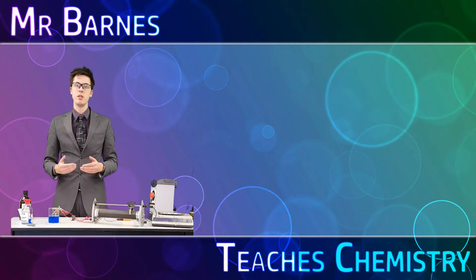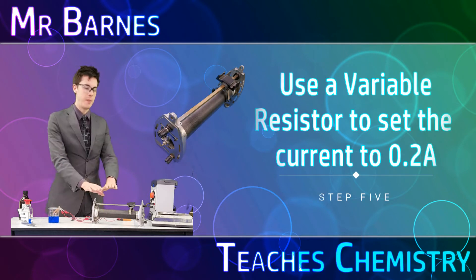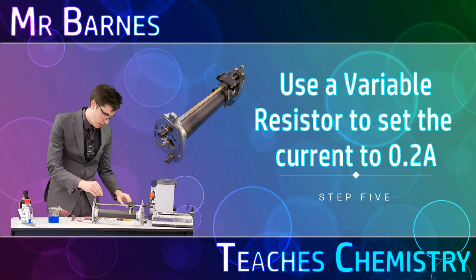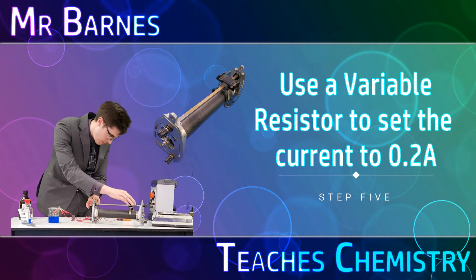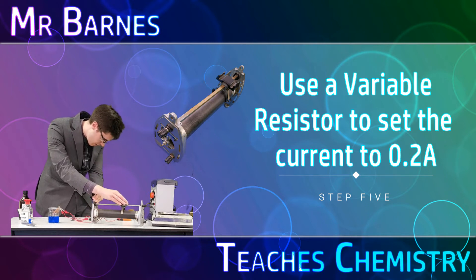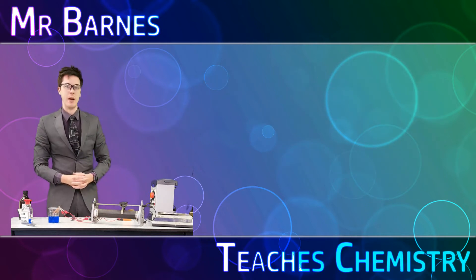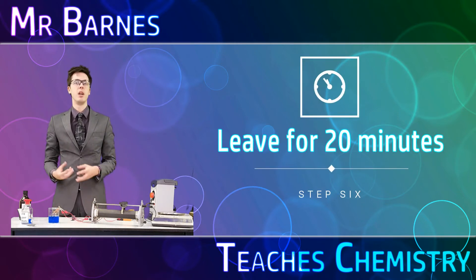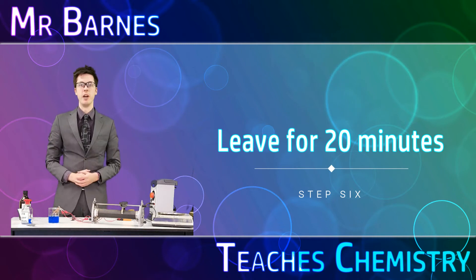You need to make sure that the current is at 0.2 amps. To do that you use a variable resistor. I'm going to move this resistor until I'm at 0.2 amps and I'm going to leave that for 20 minutes, and when we come back I'll dry the electrodes off and measure the final mass.